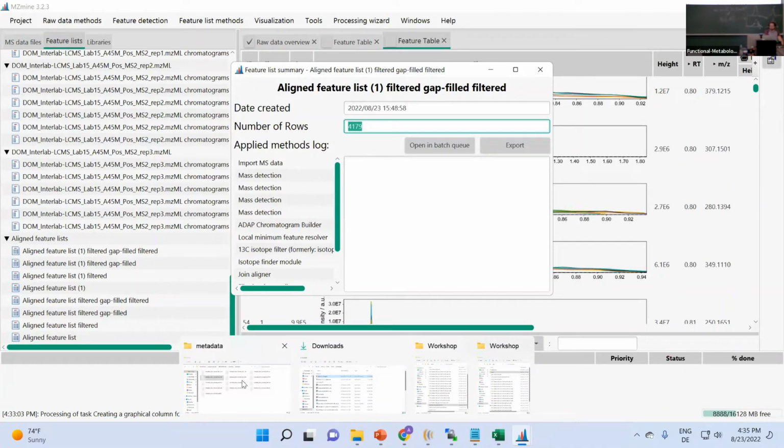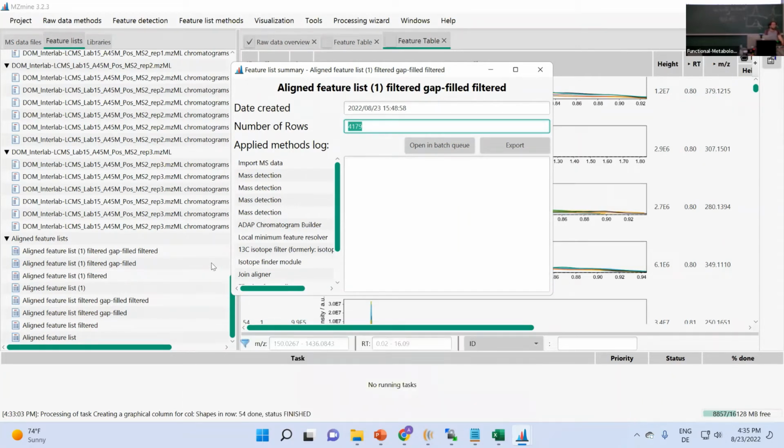Because then you see, okay, let's say there are 300 compounds identified, and if you only ID, let's say, 15 in your feature-based molecular network, then maybe something was not ideal with the settings here. Typically, if that is done well, I would expect you to have more IDs than with the classic molecular networking job, because we deconvolute isobars, right? So there should be way more features than just by the clustered MS/MS.